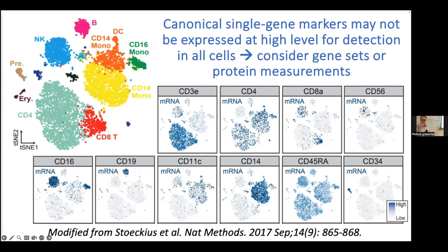And this is really a downside with single cell sequencing. Since you're reliant on that single cell, if you have a gene that's expressed at a very low level, you have these very rare fragments, and they don't happen to be sampled or amplified in your reaction, you're not going to see them. So if you have genes that are expressed right at the limit of detection of single cell, you'll have this stochastic detection of those transcripts, or no detection at all. And really where we've had to go for single cell is not necessarily rely on these individual markers, but instead move to gene sets that would tag these individual cells as surrogates for those individual, usually originally protein-based, markers. So there's really a disconnect between the RNA expression and the protein expression.